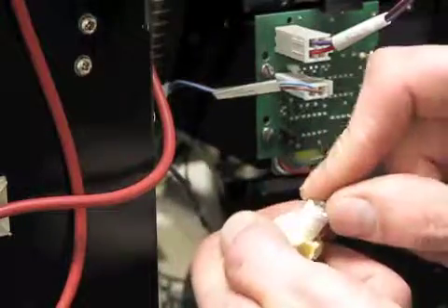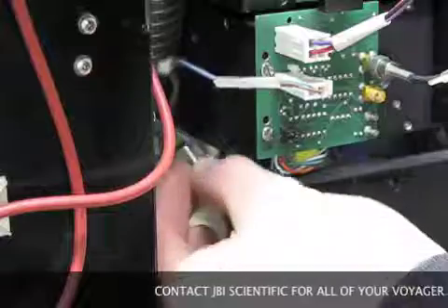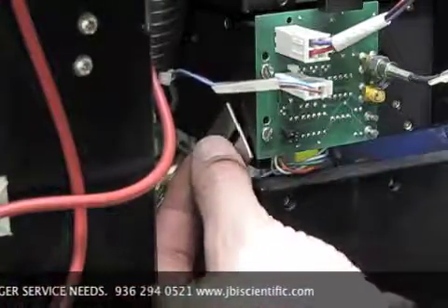Check the orientation by first plugging in the 12 volt power. If the light does not come on, remove the bulb from the bracket and reorient 180 degrees.